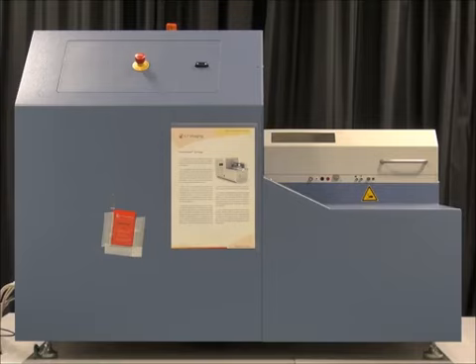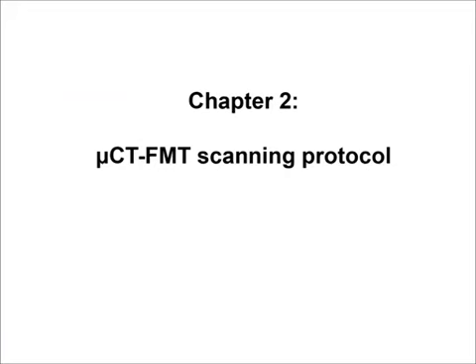This is our µCT. The µCT is equipped with 2 X-ray tubes and 2 flat panel detectors, which allow acquisition of dual energy scans. Chapter 2. µCT-FMT Scanning Protocol.